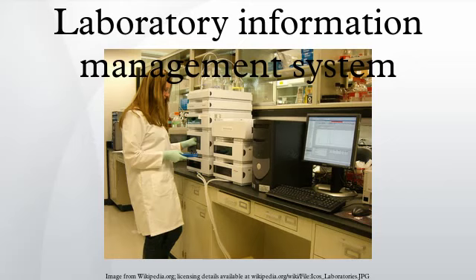Sample management. The core function of LIMS has traditionally been the management of samples. This typically is initiated when a sample is received in the laboratory, at which point the sample will be registered in the LIMS. Some LIMS will allow the customer to place an order for a sample directly to the LIMS, at which point the sample is generated in an unreceived state.